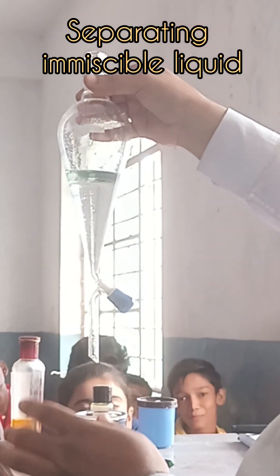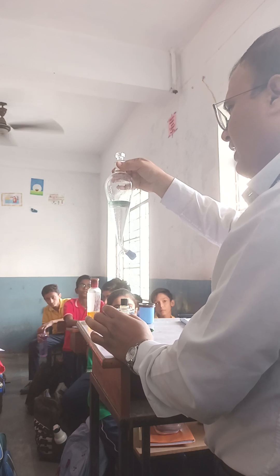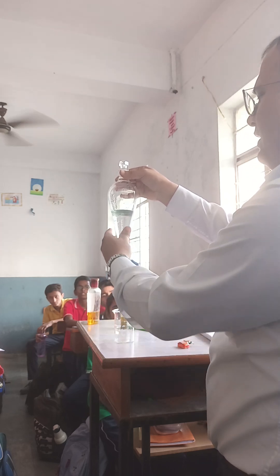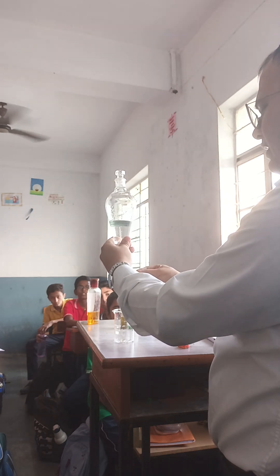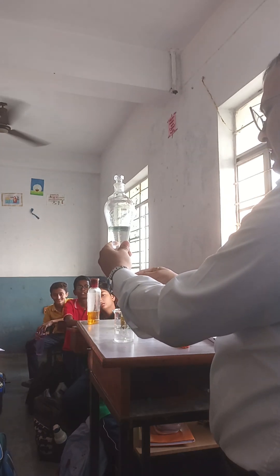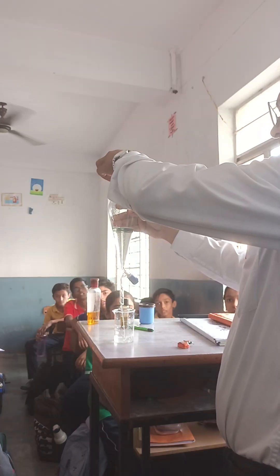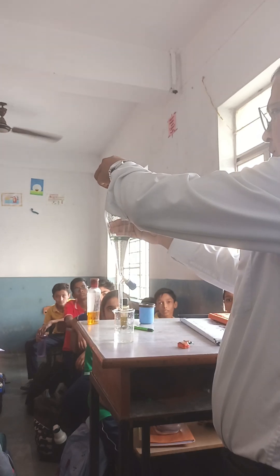This is a separating funnel with a mixture of kerosene oil and water. Kerosene oil floats on the top of the water. Now we have to separate it — open the knob very slowly.